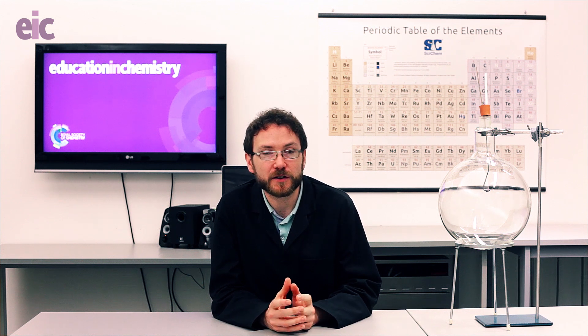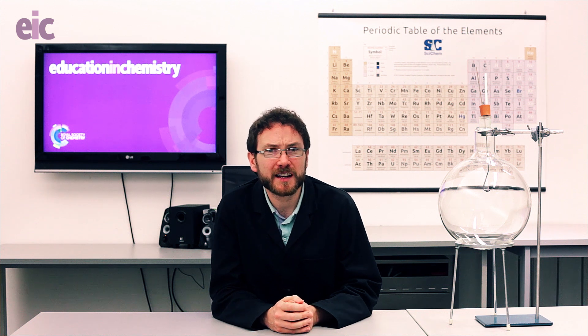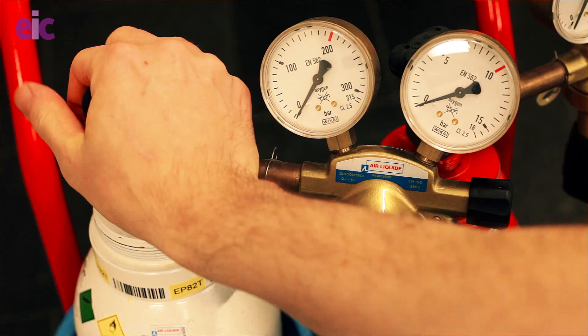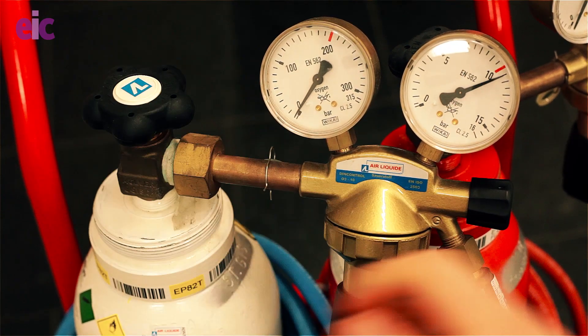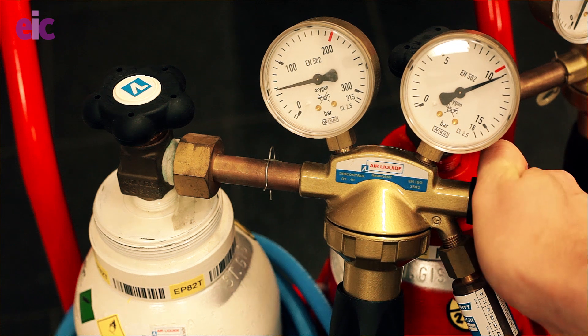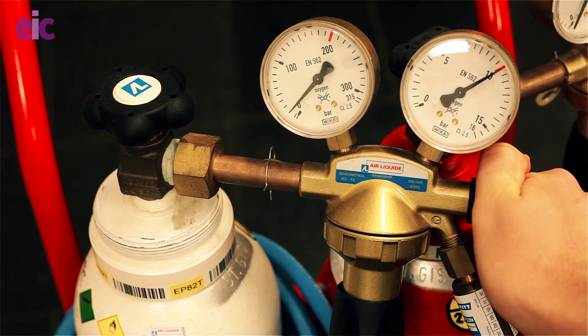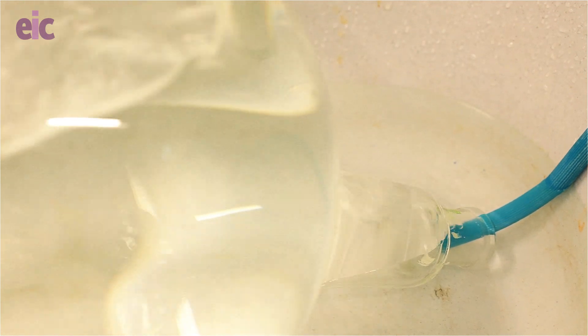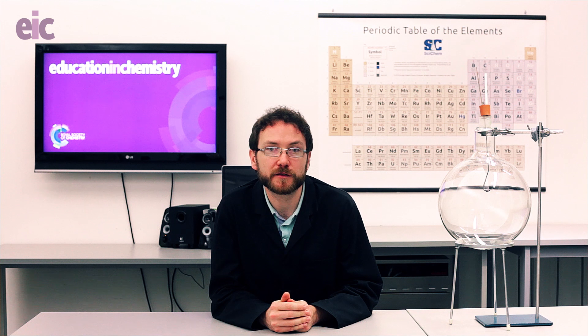You're going to be looking, ideally, for a thick-walled flask. You can actually get a fairly decent price on these flasks on eBay at the moment if you look around. It's worthwhile investing because there are so many demonstrations that just work so much better if you have a nice-sized round-bottom flask to work with. The flask is going to need to be completely full of oxygen for this to work with red phosphorus, and you can do this by downward displacement of water from a gas cylinder or oxygen generator, or you can flush the flask with oxygen gas in a fume cupboard for five minutes.